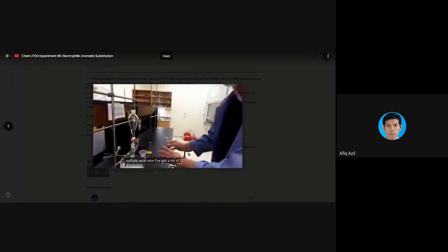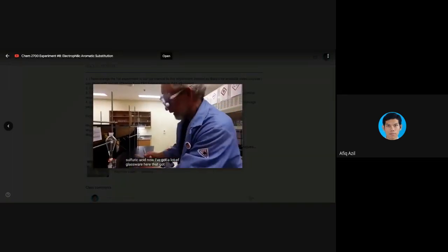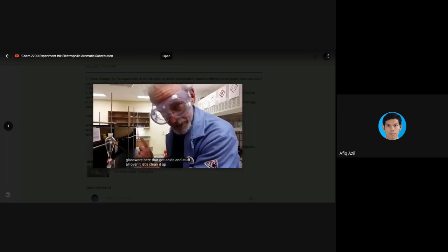Now, I've got a lot of glassware here that's got acids and stuff all over it. Let's clean it up right now.